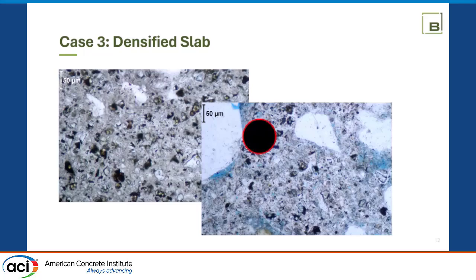Now with that LIBS, you can just go around and zap and tell me the chemical analysis in that zone. Give me an elemental map, if you will, at that point. And what it actually clearly showed over and over again, wherever I moved around, we saw an uptick of the available alkalis and iron on the surface compared to what we found at depth. And I figured this all out in about 30 minutes with my playtime. And it was all pretty much there.